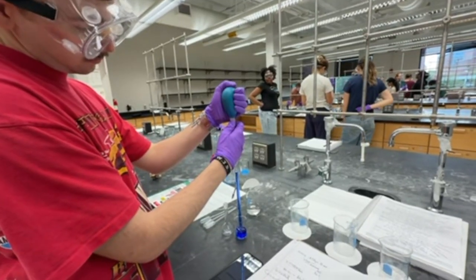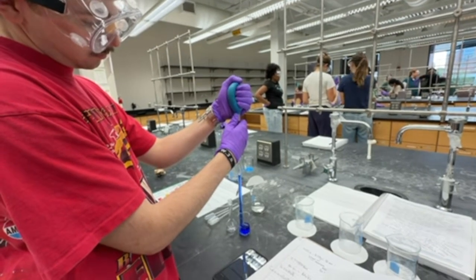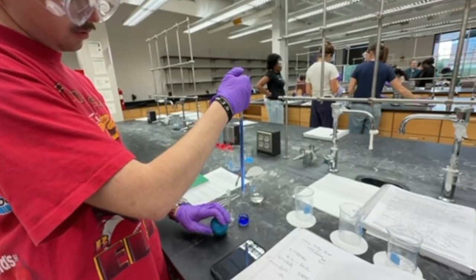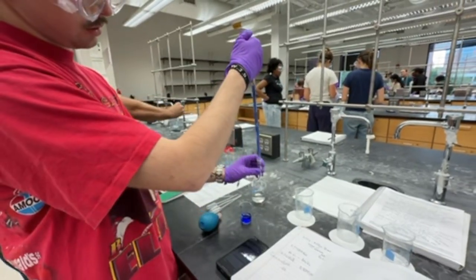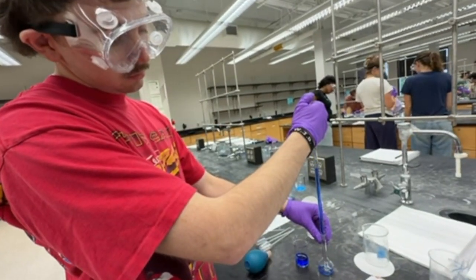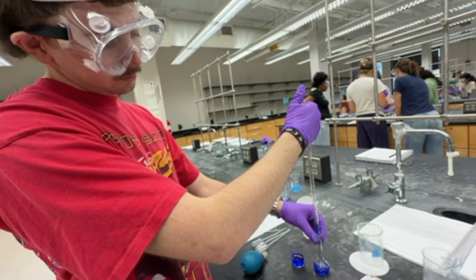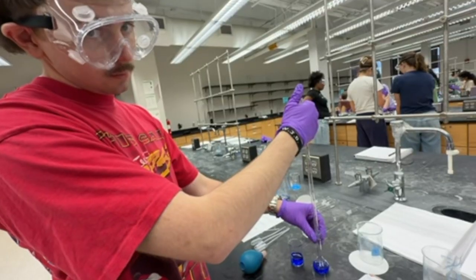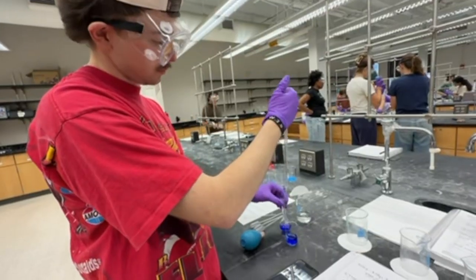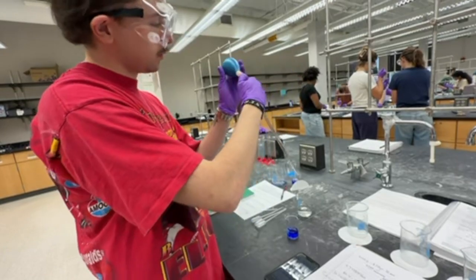Okay, this is priming it. Yeah, keep going. We have 10 milliliters here that we're going to put. We'll fill it all the way up. Is that you priming it? Great. Now we're going to use it.